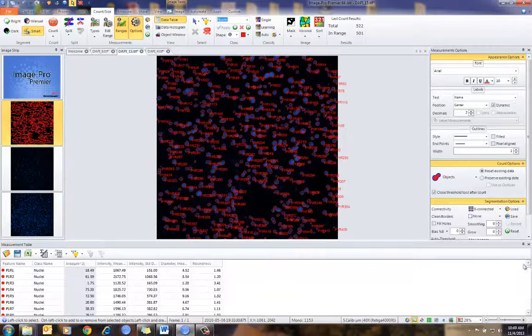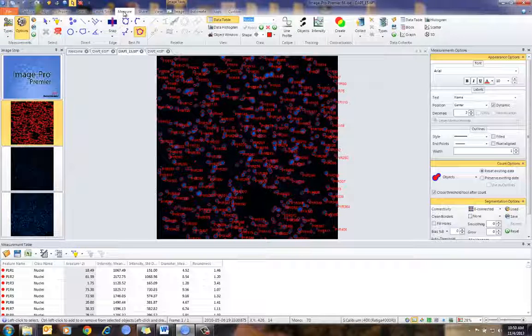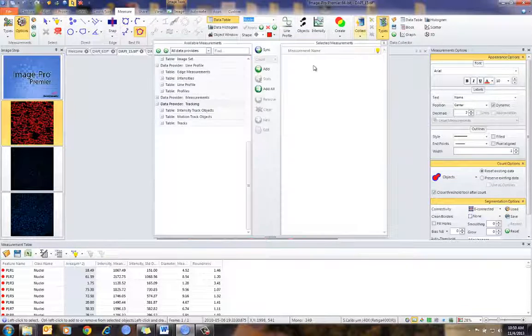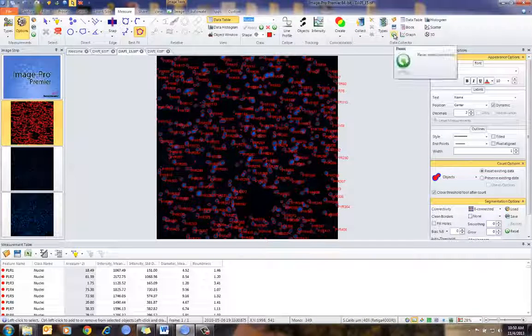Now, the important thing is in the Measure tab in Data Collector — what I want to do is clear all this data out, which I've done, and then press the reset button.